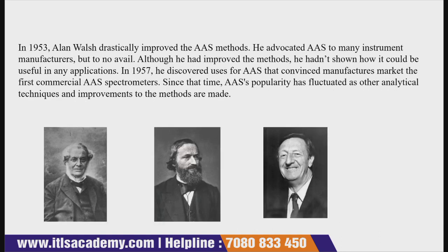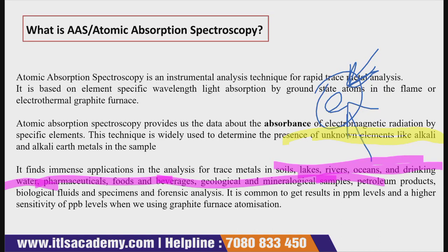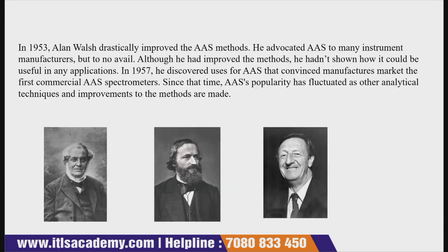Now, in the year 1953, Alan Walsh drastically improved the AAS method, that is atomic absorption spectroscopy. He improved the method of atomic absorption spectroscopy.